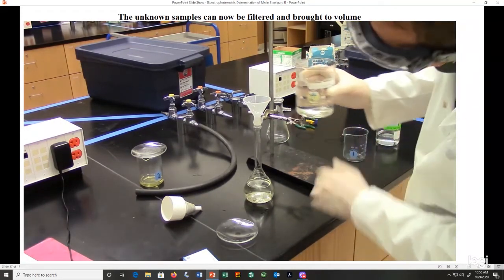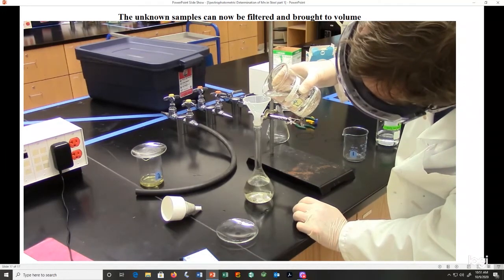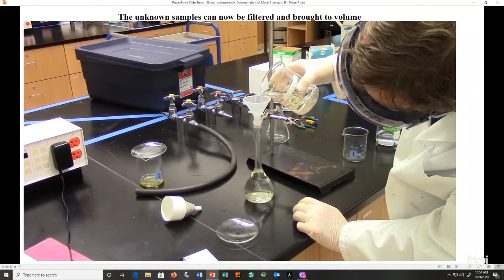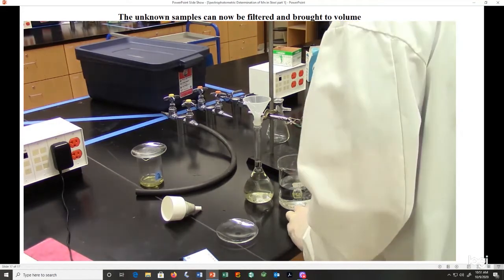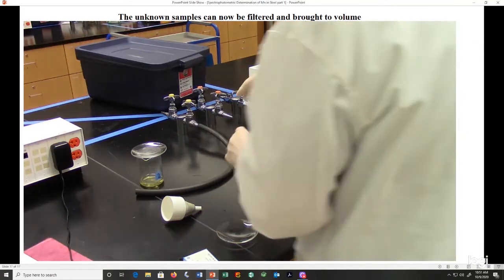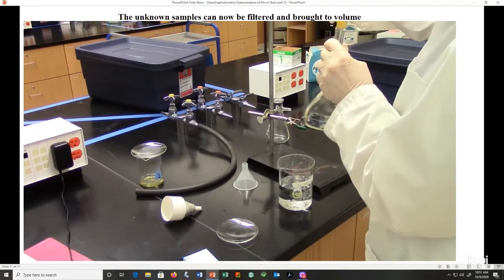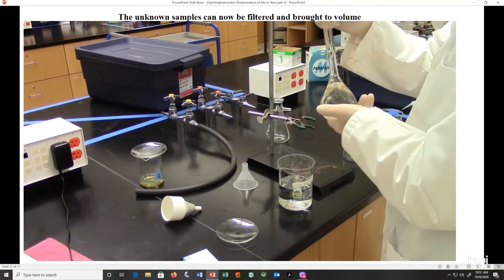Now we can fill our flask to the 250 milliliter mark. As always, we're going to want to invert this flask several times to make sure the mixing is complete.